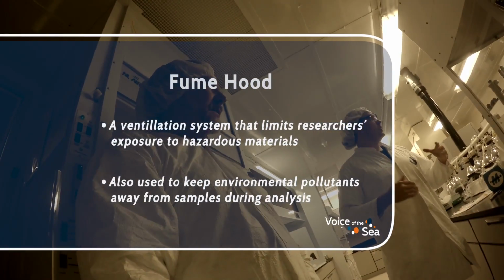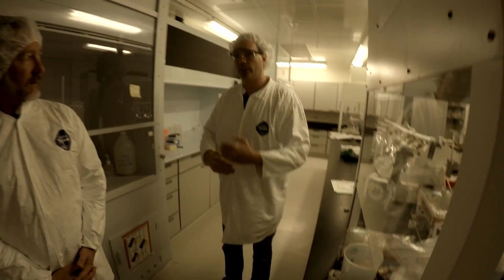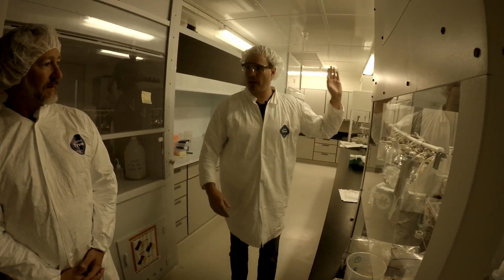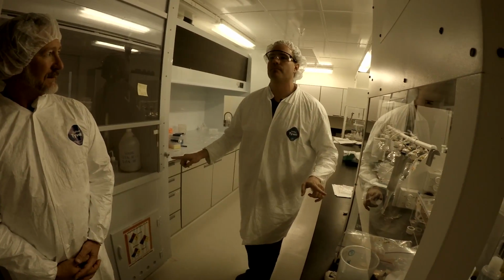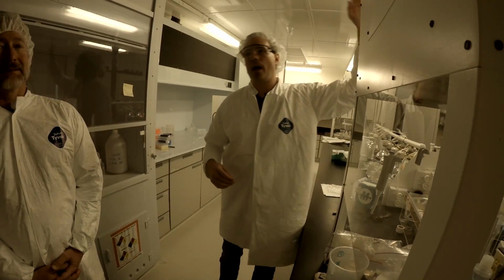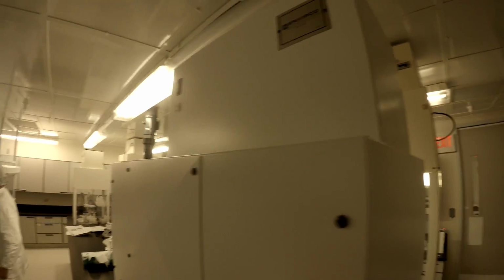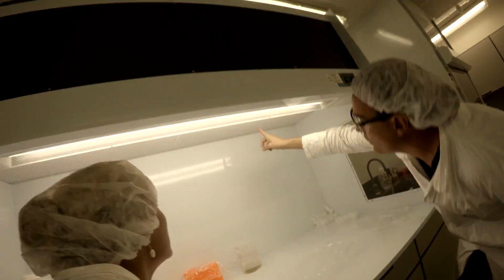So we try and keep everything clean, and we try to make things get progressively cleaner and cleaner. So this room is cleaner than the room where we gowned up, which is cleaner than the entranceway, etc. The cleanest parts in the labs are inside the hoods because they are constantly fed clean air through HEPA filters, in this case in the top, up here and up here. And if you'd like to see one of these filters, there's a large one right there behind the plastic grating. So this is all one large air filter.